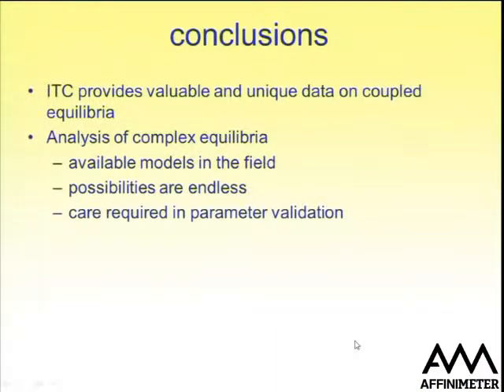So, in conclusion, ITC provides valuable and unique data on coupled equilibria. And you can analyze these coupled or complex equilibria, and as we've seen, and we're going to see more probably later on, there are a lot of different models available in the field that you could use. The possibilities are endless, but the key thing is to make sure that you really look at the validation of your optimized parameters, that they are meaningful, because it is very easy to keep switching on equilibria and get a perfect fit that is absolutely perfectly meaningless.